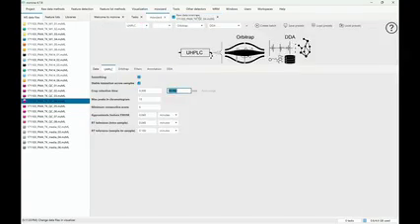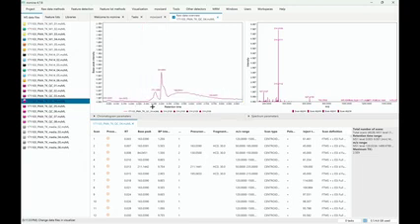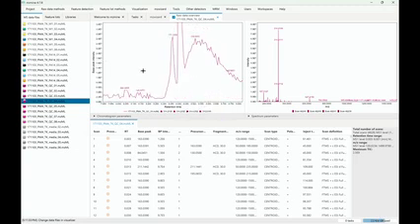And then at the end, honestly, we can either just keep the whole thing, or we could say, this one looks like a clean out step. It's not my data actually, so I don't know if it's a clean out step, but it kind of looks like that. So we could just say, okay, we're going to cut it at 8.3 minutes or something like that.